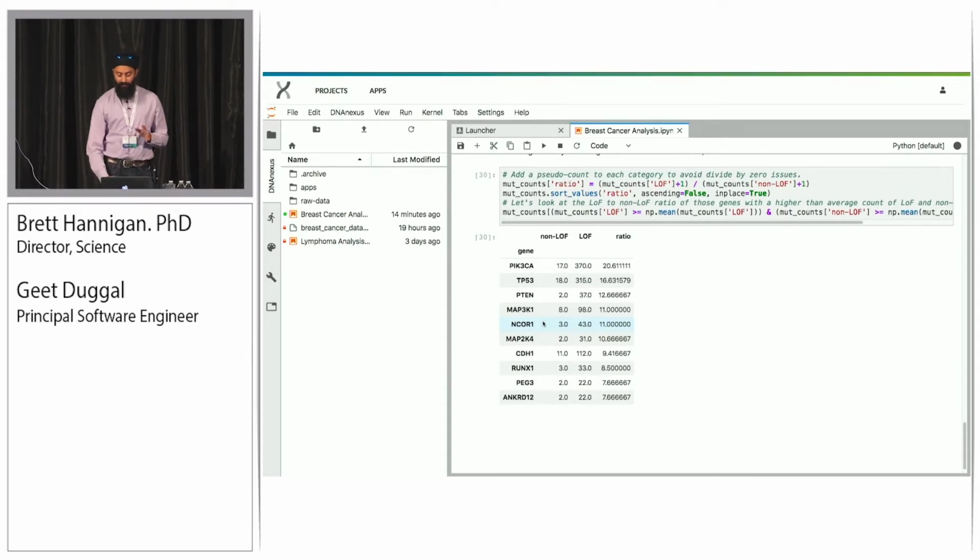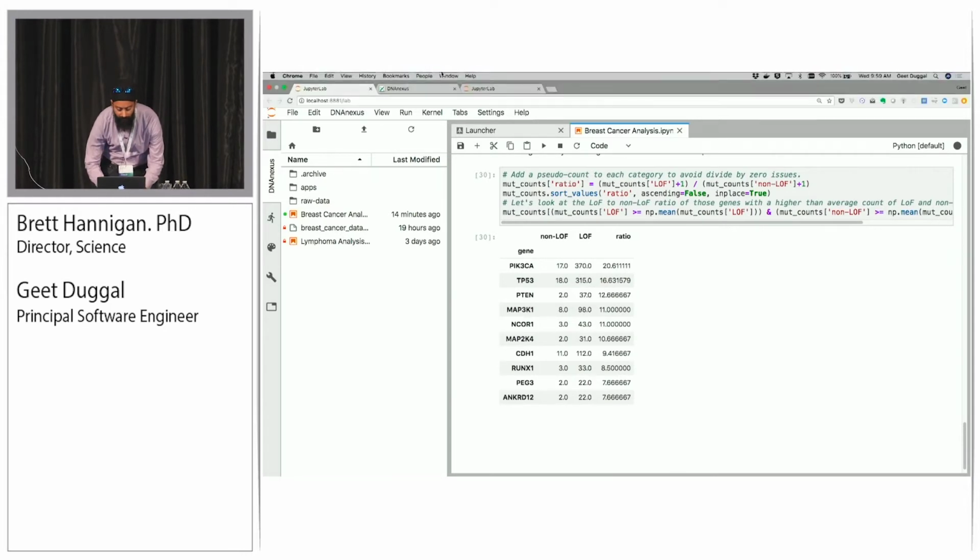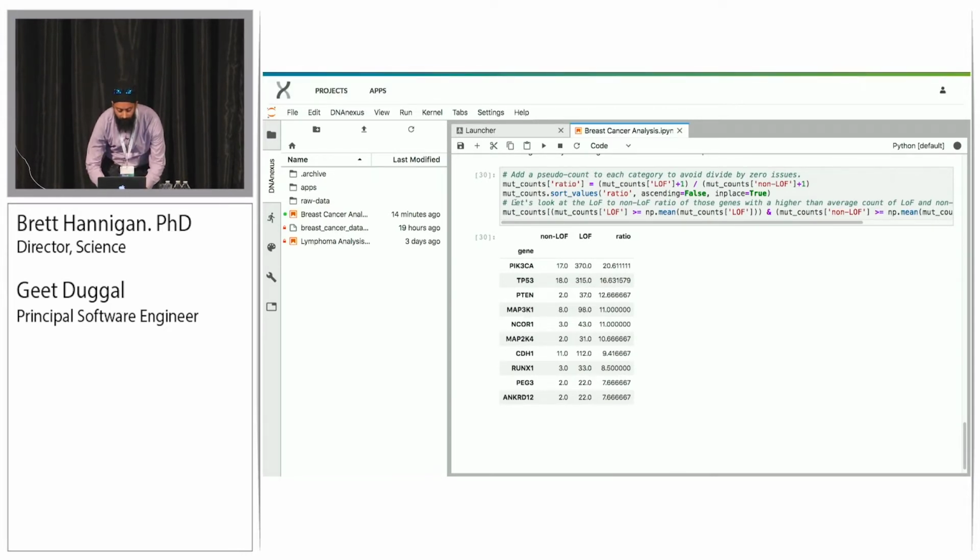Brett just gave it to me. I did an initial analysis, and I'm getting a little tired now, and I know Brett's a night owl. And I just thought I would send this his way and see if he can see what I did.